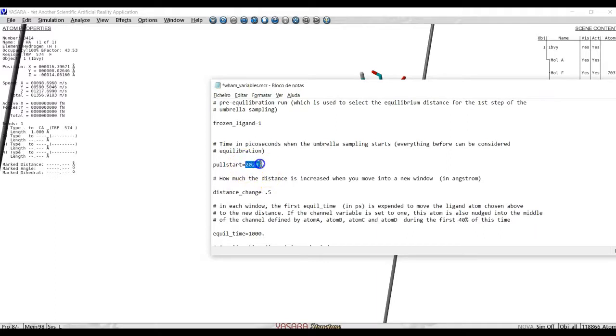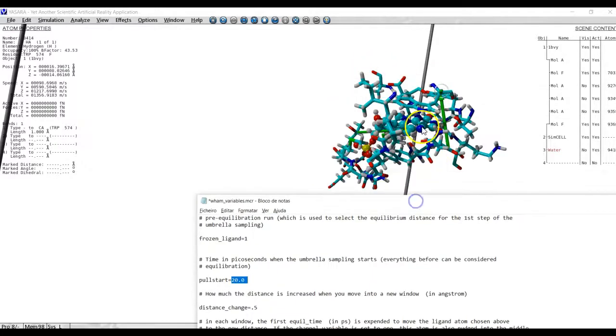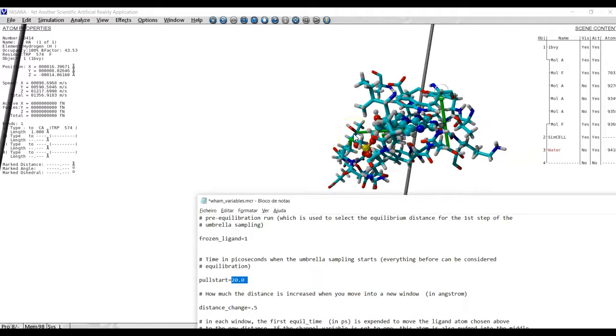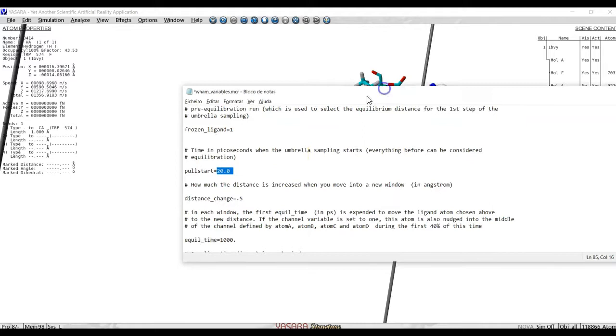Pull start is a variable which tells us how long will the computer take the average distances between those two atoms, the ligand and the receptor, before setting the spring on. So it's just used to select the initial size of the spring.